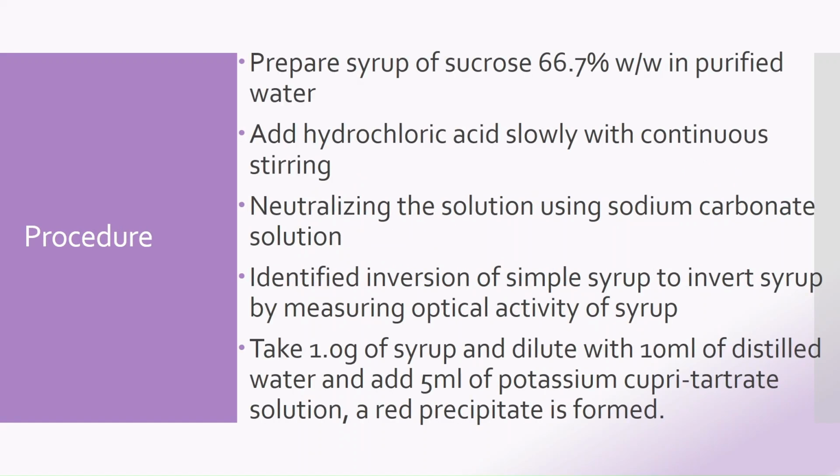Wow, here comes the procedure. Procedure of preparation. Let's dive into it. Prepare syrup of sucrose, 66.7% weight in purified water. Remember we looked at a lecture on preparation of a simple syrup.